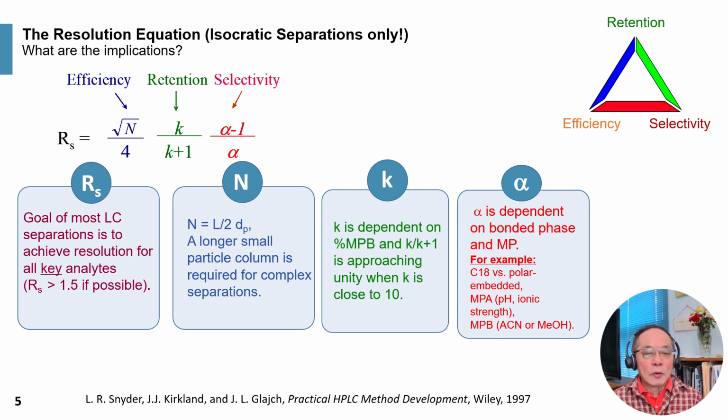In this slide, we explain the resolution equation and note that the resolution equation is really applicable for isocratic separations only. And what are the implications, right? Here's the resolution equation, one of the most important equations in liquid chromatography, where the peak resolution is contingent on three major factors.